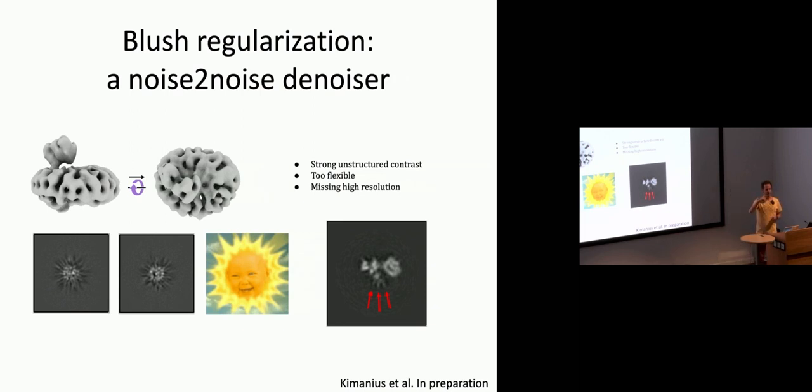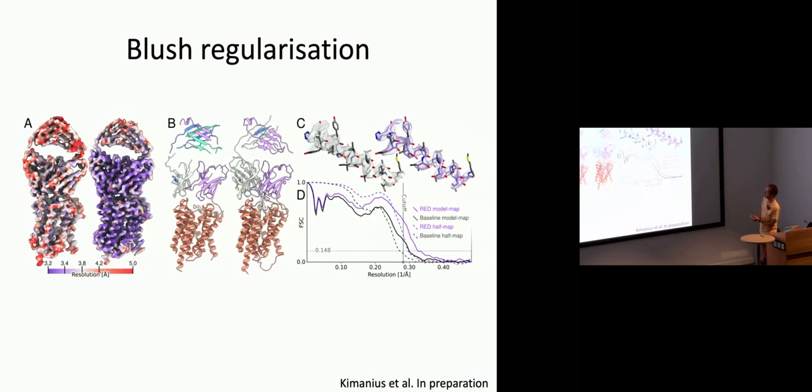Importantly, also the way it's implemented inside Relion, it keeps it all relatively conservative. We now think we have something that does not really hallucinate. We do not push it towards making it look like protein; we focus more on removing some of the artifacts that happen when things go bad. And BLUSH regularization for this PfCRT is the same structure that I just showed slices through from the non-uniform refinement paper from CryoSPARC. You can now do it even better using BLUSH regularization in Relion.